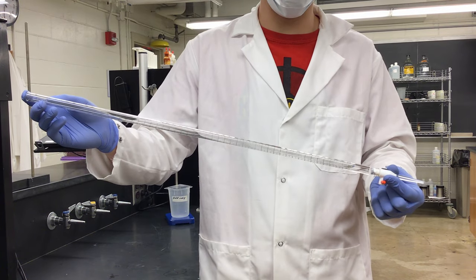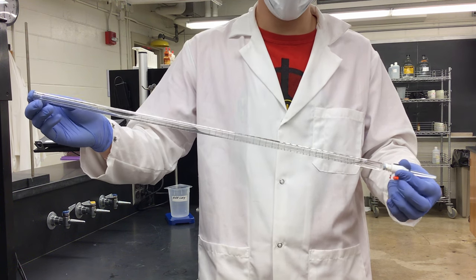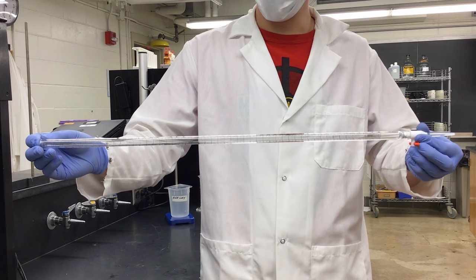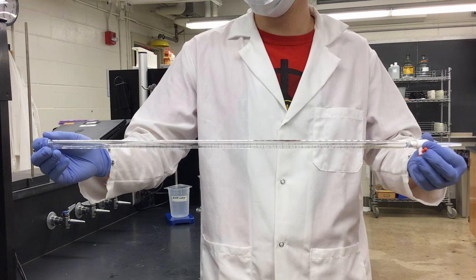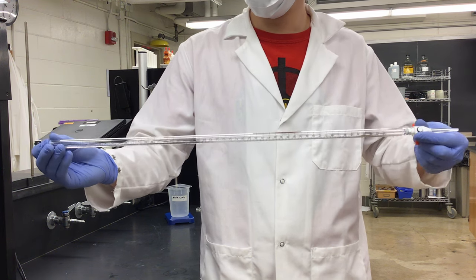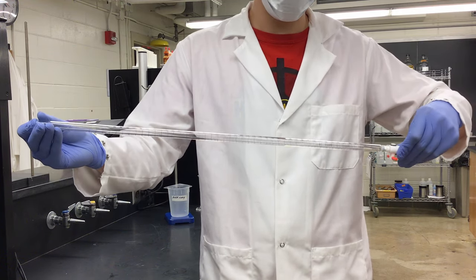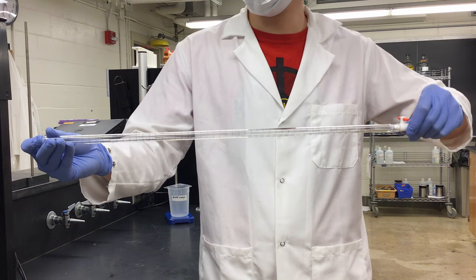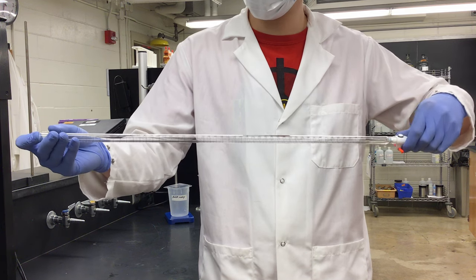Now I have my burette with three milliliters of 0.1 molar sodium hydroxide. To rinse it, I want to hold the burette almost horizontal — but not so much that it runs out the end — so I have it capped with my finger, and I just roll my titrant around inside the burette. This thoroughly coats the walls with our titrant and picks up any remaining water which would otherwise dilute it.